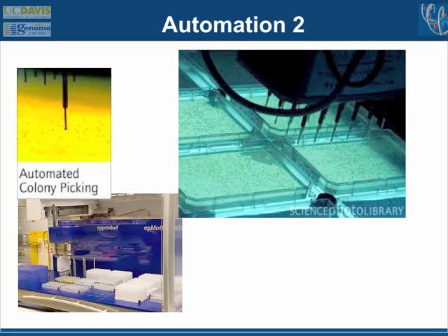So what we would do, and what we mainly worked on, was automation of this colony picking. So you would take a DNA sample, shred it, put it into a plasmid vector, ligate the ends, and then electroporate that library into E. coli. Plate those E. coli strains out on typical E. coli growth plates. And now you'd get a few hundred colonies on one plate.